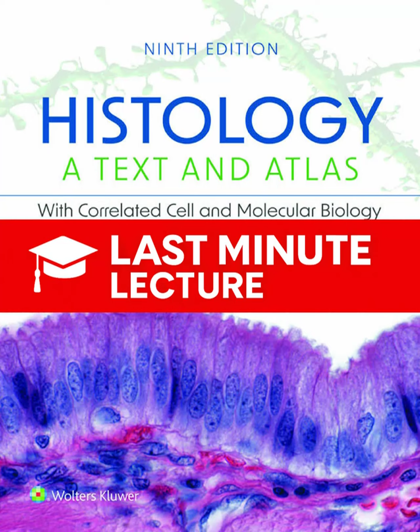How so? Well, formalin is effective because while it stabilizes the proteins, it doesn't really mess with their three-dimensional shape too much. And preserving that native structure is the bridge that lets us use modern, super-specific techniques later on. Like immunocytochemistry. Precisely. Because the antibodies you use in that technique need to recognize a very specific 3D shape, the epitope, to bind correctly. Formalin keeps that intact.